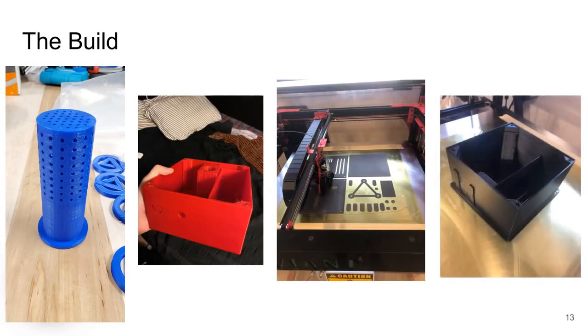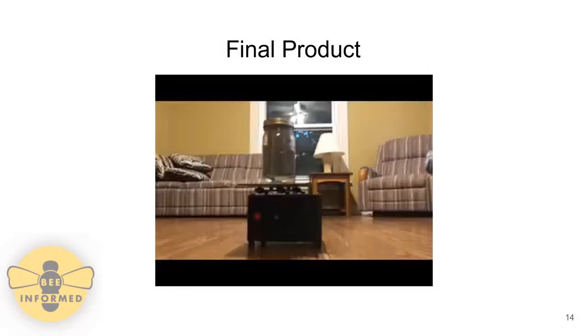Images of components for the mite removal jar and orbital shaker are shown on this slide. From left to right: a 3D printed bee mesh, a prototype for the base of the orbital shaker, the 3D printer printing components for the orbital shaker, and the final box for the orbital shaker. Here's the final product — the circular motion of the shaker creates turbulence inside the jar that helps dislodge the mites from the bees.